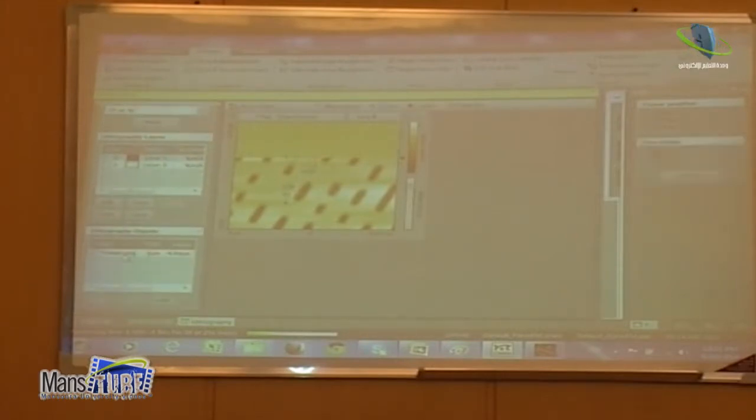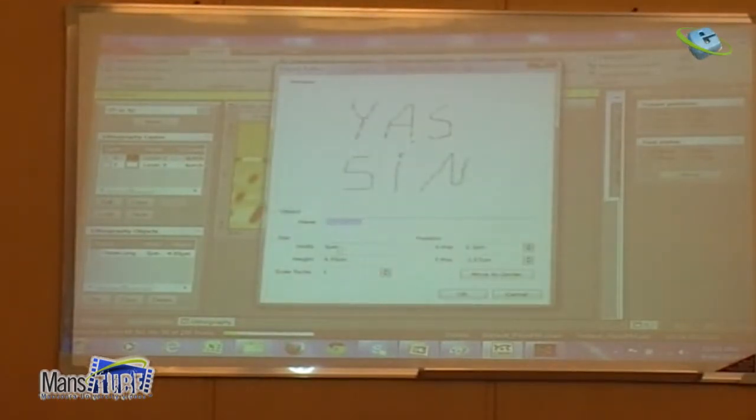And I will select here. Maybe I can make it smaller if I want. Maybe 2.